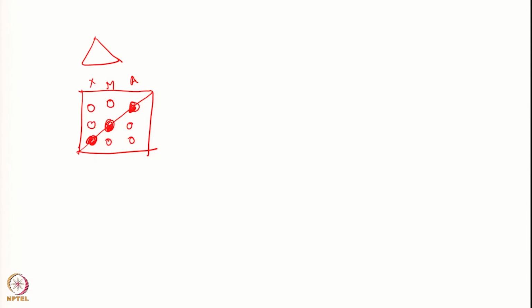Okay. So all these are cross peaks. Now in each one of them we will have one active coupling and one passive coupling. Okay. In the same line. So let us say this is AX, that is this peak.